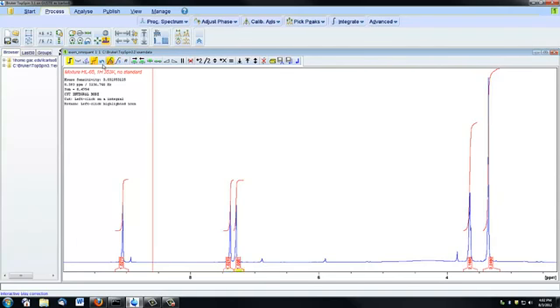And again. And for this final one, I'm actually going to make it shorter so that I can see better before I go ahead and flatten out those slopes.